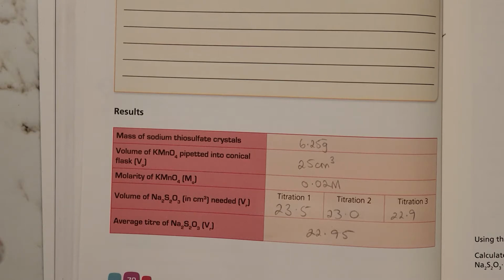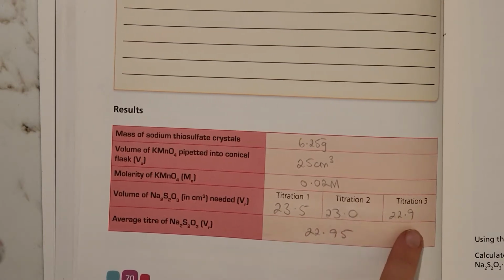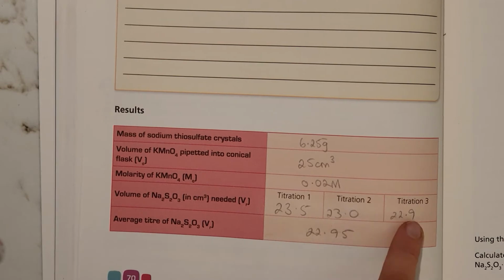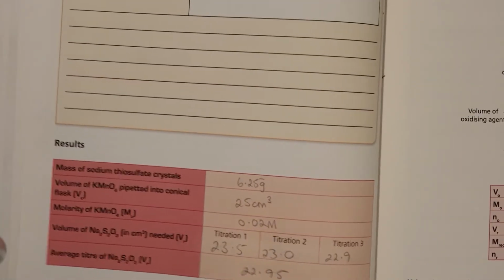The average titer should be around 23-ish. So it depends on the accuracy and the concentrations of both your sodium thiosulfate, your iodine, and sulfuric acid, and the potassium permanganate. So to find the average, you go to the ones that are within 0.1 of a difference, add them, divide by 2, and you should get your average titer. Okay, so bring it over here.